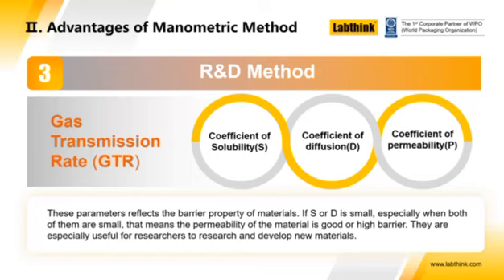So although D3985 has gained popularity as a go-to method, or main method if you like, for measurement of oxygen transmission rate, it is acknowledged that the results obtained from the manometric method may be compared with those obtained from the coulometric method. And our own experience of this is proven in the fact that we take part in several independent interlaboratory or round-robin studies every year.